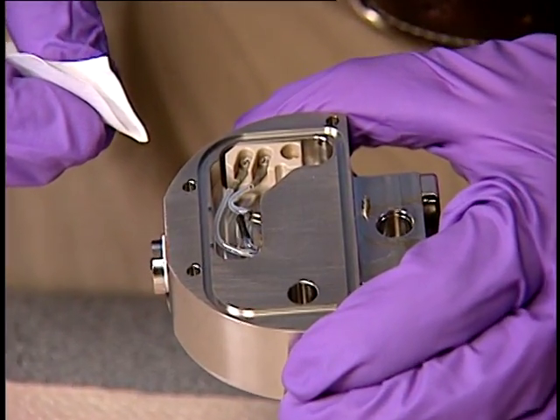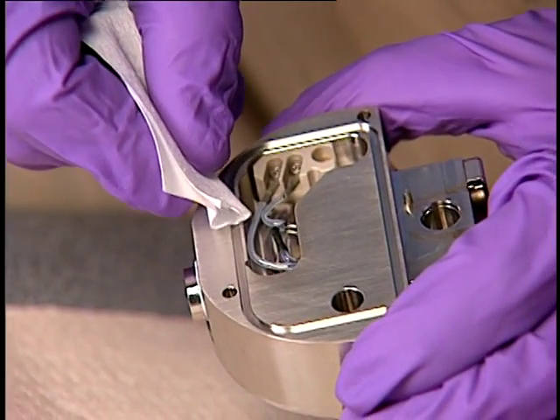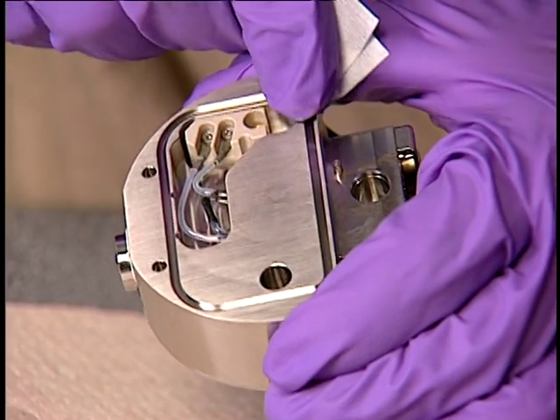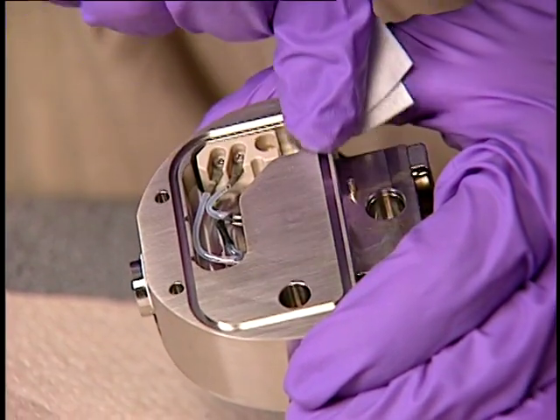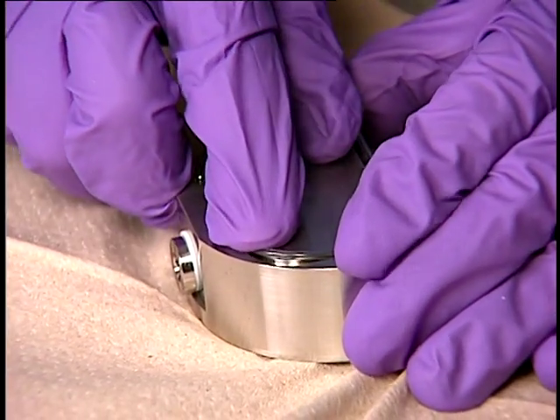Next, ensure that the grooves for the cover seal are free from dirt and debris. If contamination is present, use a one-to-one methanol water solution applied to a lint-free cloth to carefully clean the grooves. Fit a new cover seal to the ion block, ensuring that it is correctly seated.